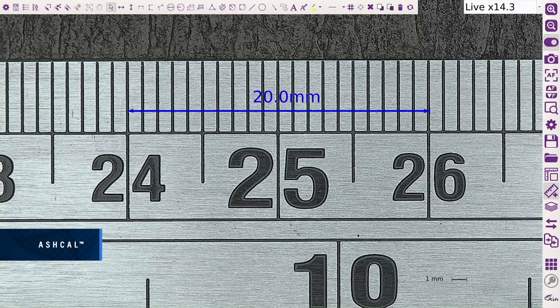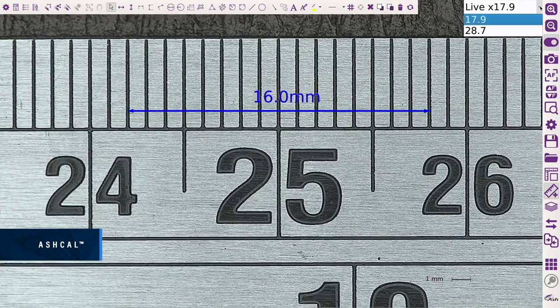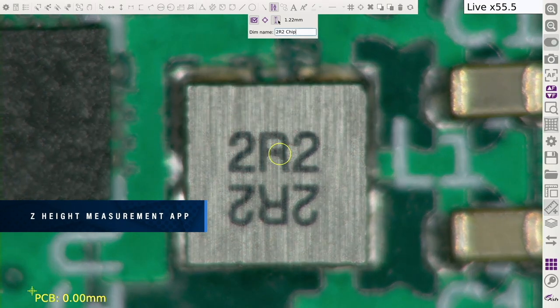Enhanced AshCal Calibration Technology continually maintains calibration at all magnification levels, removing the need for manual setup and recalibration, saving time and increasing efficiency. AshCal Calibration Technology is unique to Ash Systems, measured in 3D on the Omni 3.